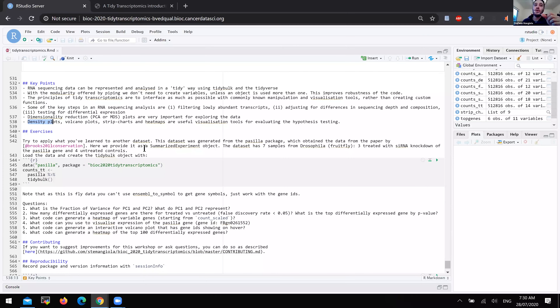Question: can you run PCA for dimensions other than PC1 and PC2? Yes — you use reduce_dimensions with the argument dim. You type your max dimension number and those dimensions will be added to your data. By default it's two, but on the tidybulk readme and vignette there is an example — a really useful functionality is GGpairs from the GGally package, where you can plot all versus all reduced dimensions and show density plots that are even more informative than scatter plots.